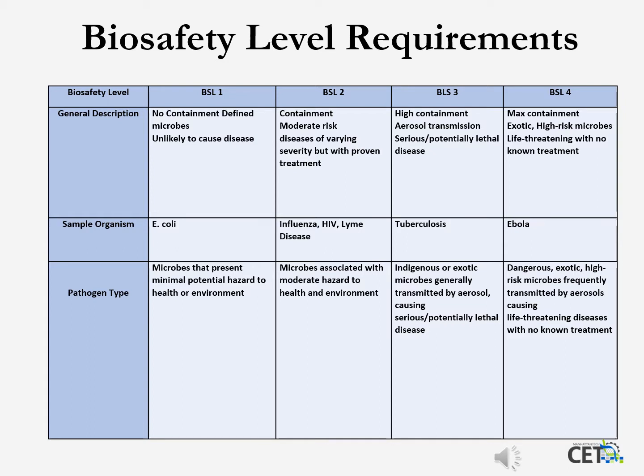This chart is a summary of the different biosafety level lab features that we've been discussing. You'll see a general description of those levels and a sample organism or disease, and then the effect those organisms or diseases have on us. If you're doing the skills training portion of this training, there will be much more discussion about all of this, including the mechanical features needed to meet those requirements.